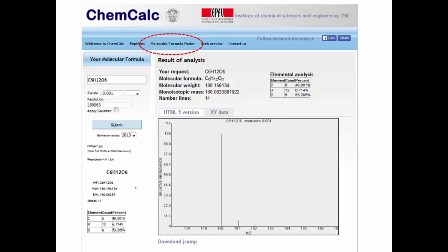So we have our mass, and we want to do something with it. The best way to work now is to use some type of a program, and there are many programs available online, but I'll recommend this one here. So chemcalc.org, that's the site you want to navigate to, and there's no downloading required to use this program. It's all available online.